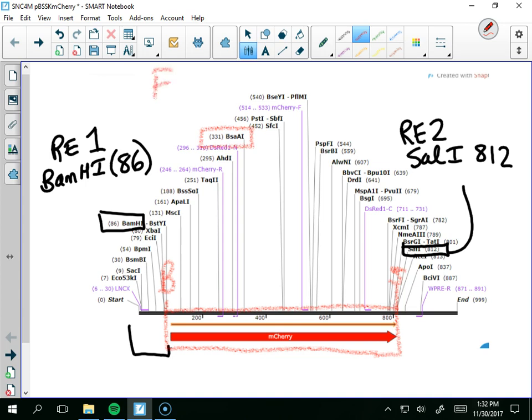We're going to call that FP for fingerprinting. So what's that, 331? You're free to take out your calculators to do some numbers. And if you want to use your calculator on your phone, that's fine.